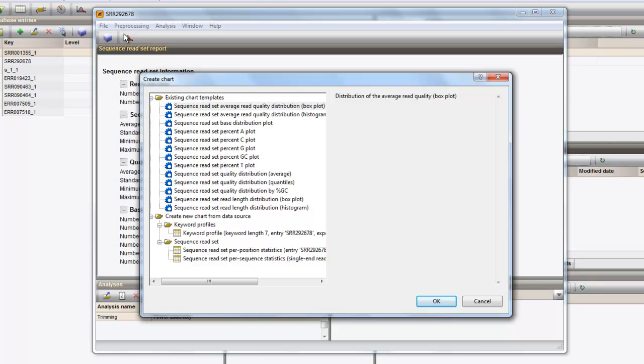As an example, we can select the existing chart template to plot the average read quality distribution and press OK.